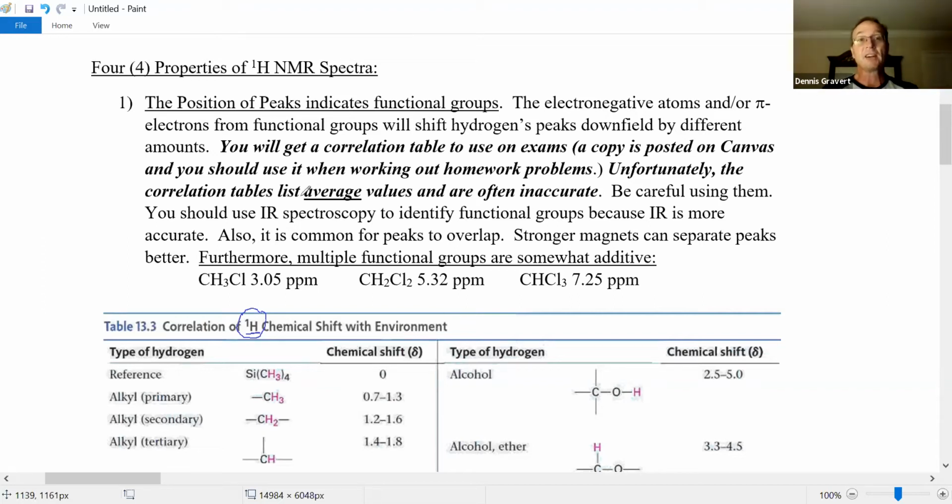If you really want better data about functional groups, hopefully you have the infrared spectrum. Or if you're doing research, go acquire the IR spectrum of your unknown compound. That could actually do a better job of figuring out which functional groups are in your molecule.